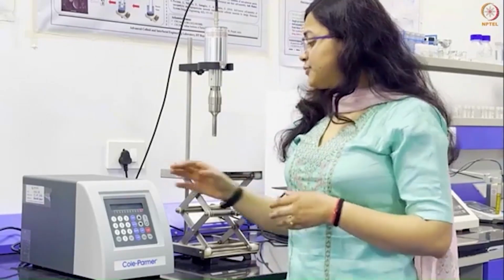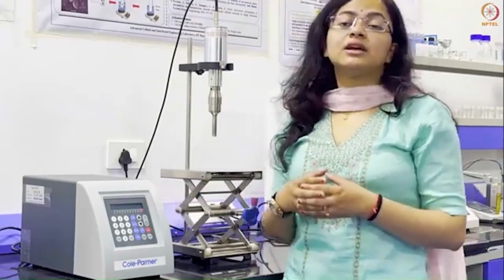Demonstration on probe sonicator. Ultrasonication, also known as sonication, is a high-frequency, powerful device that breaks large particles into smaller fragments and is also used to achieve uniformly shaped particles in a liquid sample. This probe sonicator has versatile applications in the field of chemistry, biology, material science, and food processing.